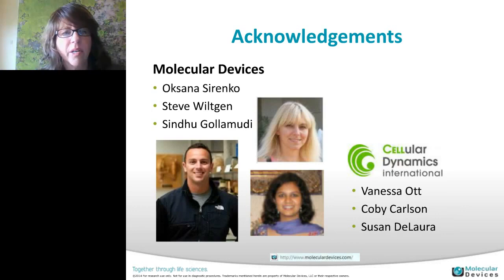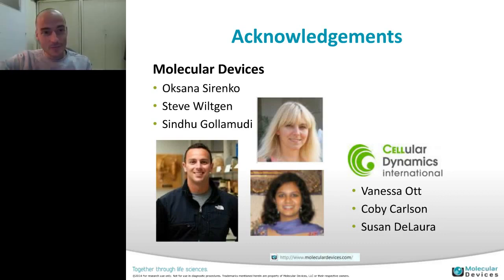Okay, our next question is for Oliver. Are you interested in other cell death pathways, necroptosis, others, RIPK activation? Oh yes, of course. Unfortunately, there has not yet been a reliable image-based biosensor developed to detect the activation of RIP kinases. So necroptosis definitely is something very interesting for us, and we're eagerly looking for tools to run this in an economic high throughput fashion, not using massive amounts of antibodies.